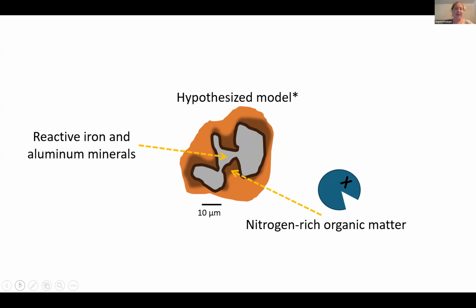So with EDX, energy dispersive X-ray spectroscopy, we can get good spatial detail, but no ability to actually show the speciation of carbon, what kind of carbon compounds are present. With techniques such as X-ray absorption spectroscopy, we can get chemical information about carbon forms, but are potentially limited by spatial resolution, not being able to probe the sub-nanometer scale needed to look directly at the interface.